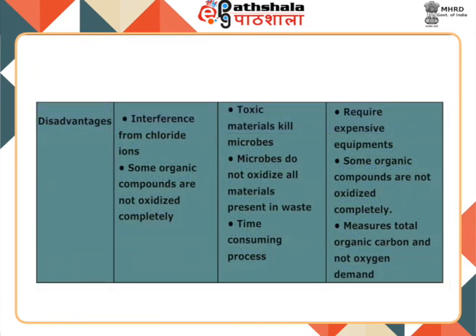Disadvantages. COD has interference from chloride ions. Some organic compounds are not oxidized completely, while BOD has interference from toxic materials which kill microbes, and microbes do not oxidize all materials present in the waste, and it is a time consuming process, while TOC requires expensive equipment. Some organic compounds are not oxidized completely and it measures total organic carbon and not oxygen demand.